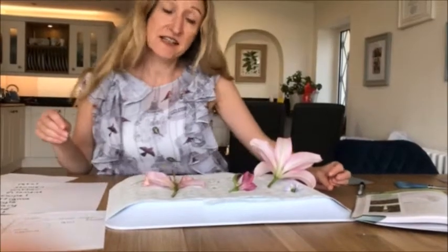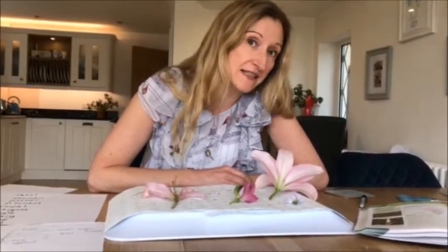Hello Year 10. So today what we're going to have a look at is a flower dissection, and we're going to try and identify the different parts of a flower that's insect pollinated. So pollination is where pollen is transferred from one part of a plant to either the same plant, which is self-pollination, or another plant via the wind or an insect like a bee.